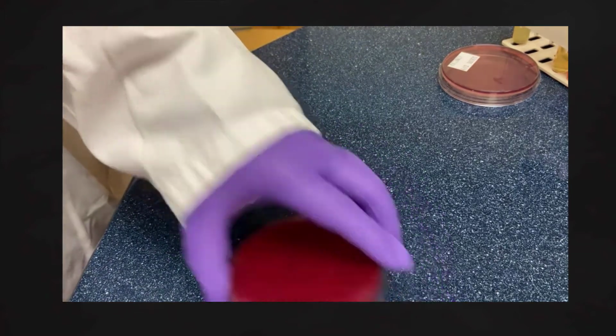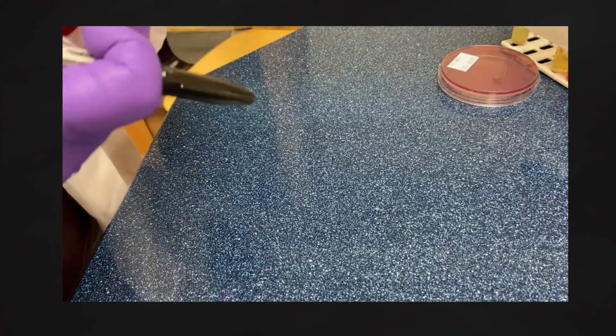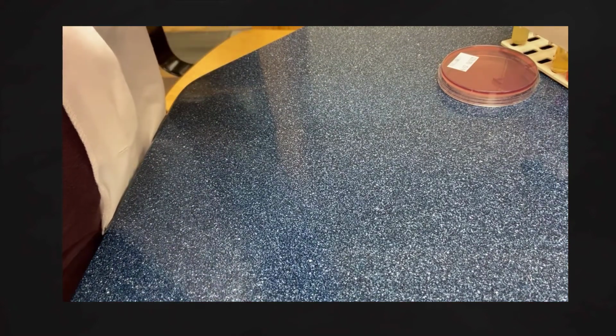Again, we need to make sure that we label our Petri dishes. We want to put our initials, and then in this case, we know that we're dealing with E. coli, so we're going to label it as E. coli.